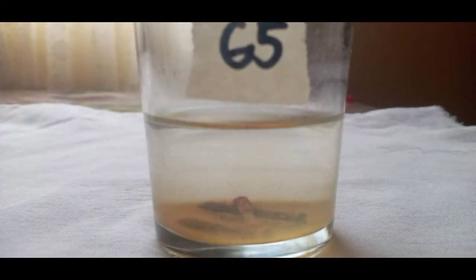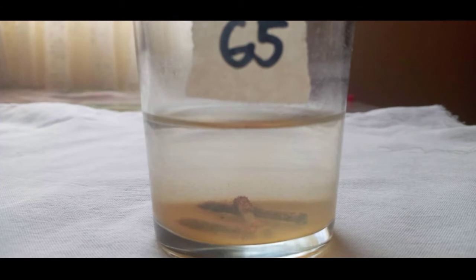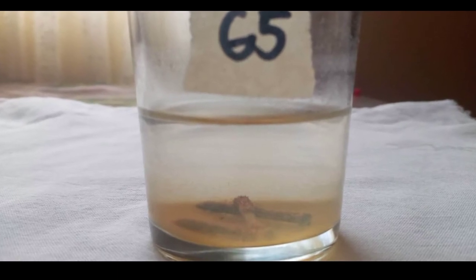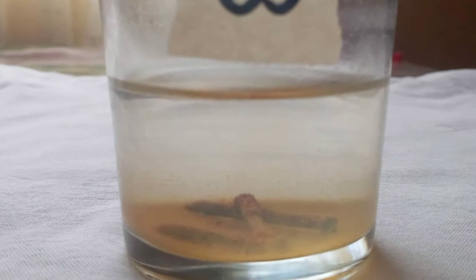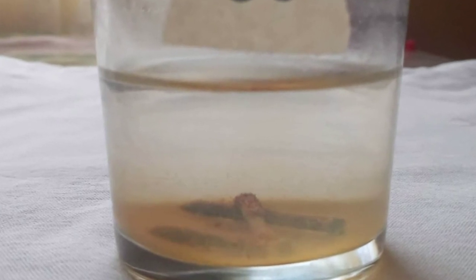Glass 5: The nails' rusting level is high. There are tiny dot-like particles that were visible to the nails which coated the nails. The discoloration of the liquid medium is evident. The water really had this rusty color.